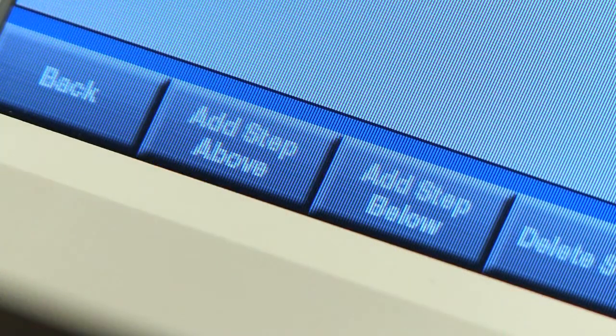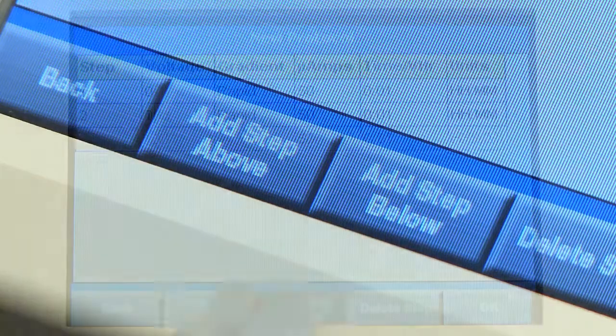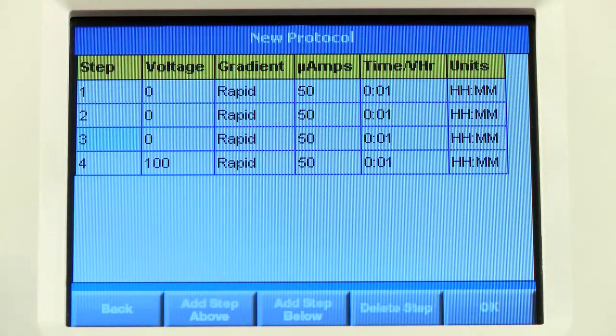Steps can be added above or below the step highlighted in blue. The highlighted step can also be deleted.